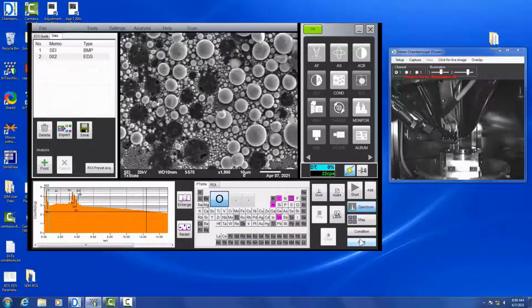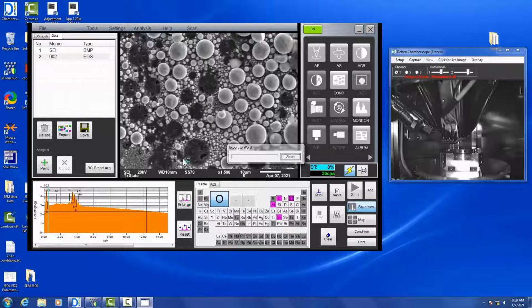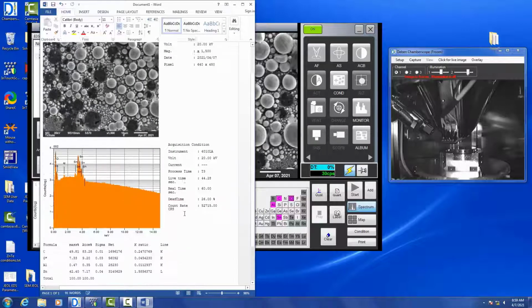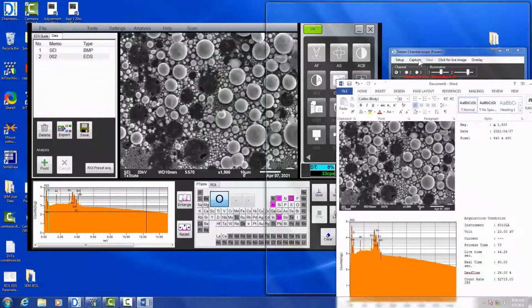So I added oxygen, and I'm going to make sure I hit the quantify button and then the print button for my report. You hit the quantify button to save any elemental changes that you made. And now we have our report with our carbon, aluminum, and tin that the computer selected, and then the one we added for oxygen that I selected myself.